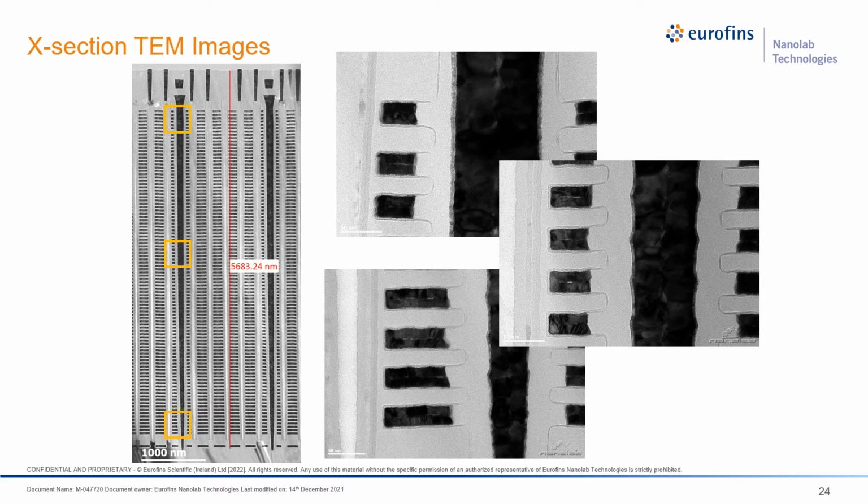So this is one example low mag TEM image of a 90+ layer 3D NAND structure. It is around 6 micron deep. And here are some zoom-in TEM images at top, middle, and bottom. In all of these images, you can clearly see the polysilicon channel, silicon oxide and silicon nitride layer, the barrier layer, and also the metal contact, and so on. You can easily do manual measurements for all of these features in one channel line.